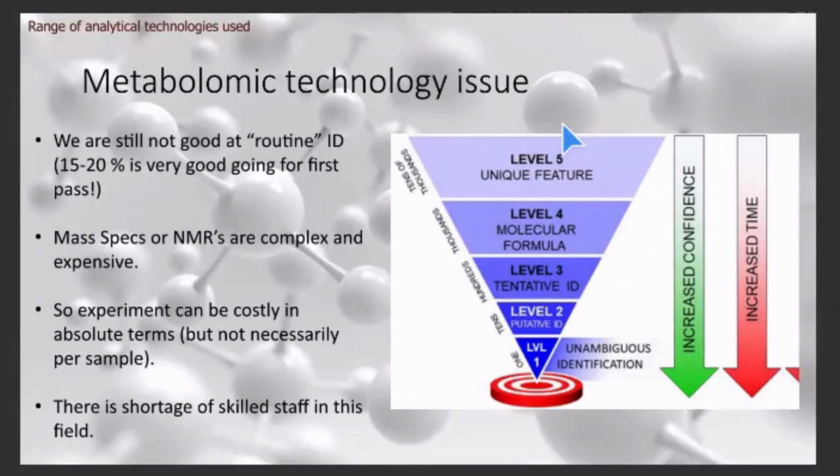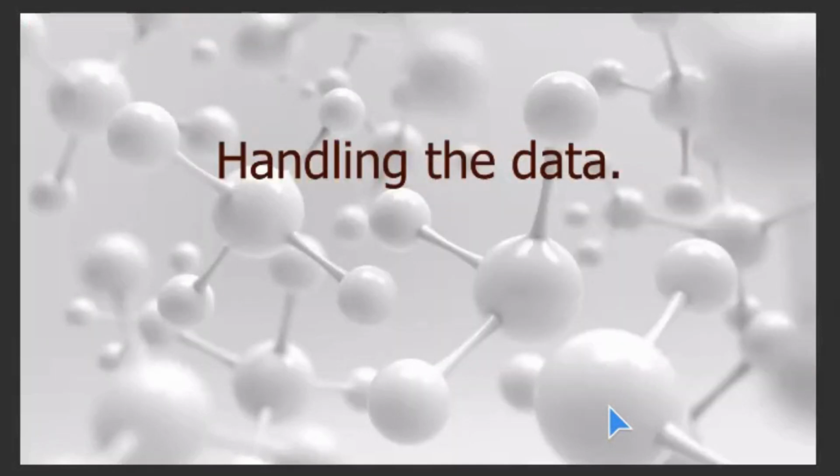There's a cost in terms of how far and how deep you want to go down into the identification of molecules. There are different levels, going from we just want to see that we think it's a feature, all the way down to actually identifying what that actually is. And we have different workflows to get there. The take-home message is basically, as you try to be more confident in what you've got, there is increasing time and increasing cost to do that. So you need to tailor how far and what you identify for how much time, how much money, and what your specific need is.